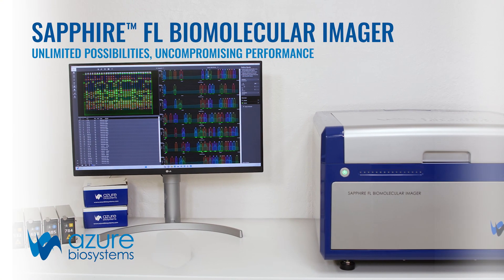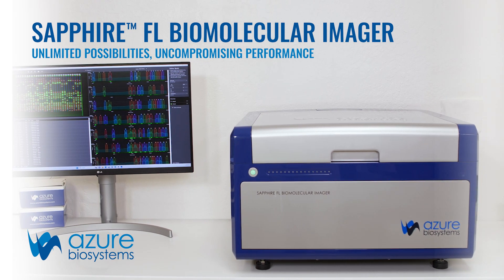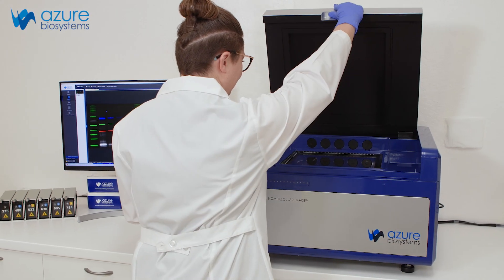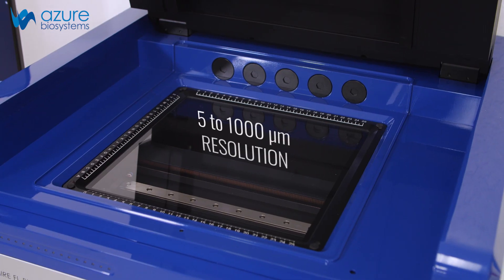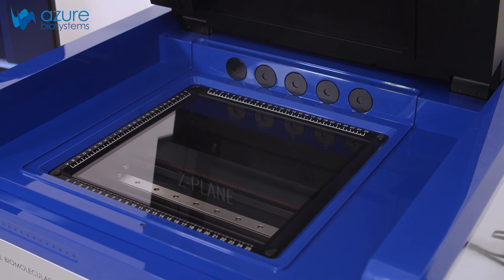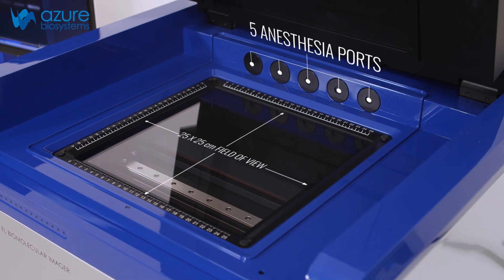The Sapphire FL Biomolecular Imager is a revolutionary laser-based imaging system created for flexibility. Designed as a single instrument to handle a lab's image scanning needs, the Sapphire FL blends outstanding performance with unmatched flexibility. The result is a one-of-a-kind instrument that supports a wealth of applications.